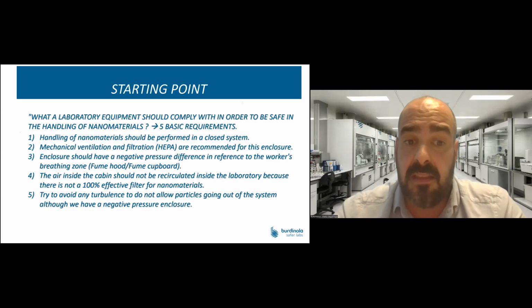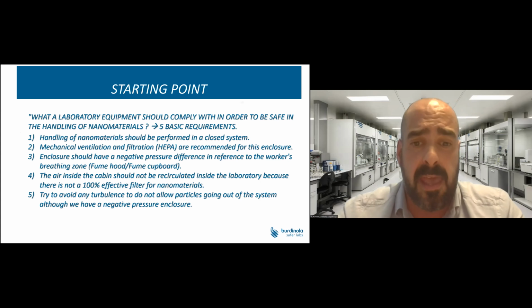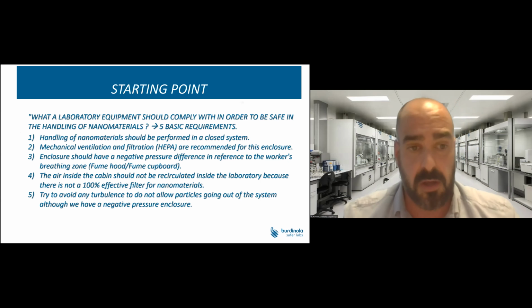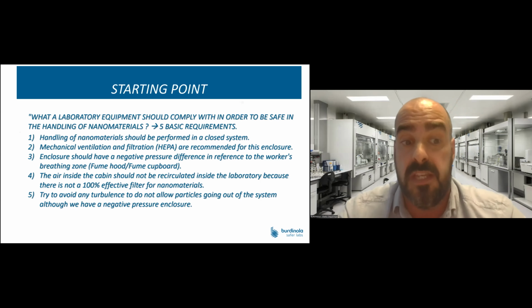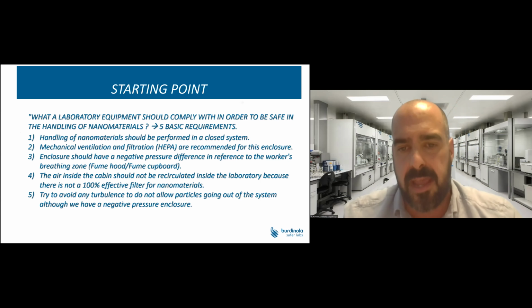And the air inside the cabinet or the enclosure should not be recirculated inside the laboratory, because for the moment there is no 100% effective filter for nanomaterials, not ULPA, not HEPA, no filter is 100% effective, okay? And we should try to avoid any turbulence so particles do not go out of the system. Although we have a negative pressure, we can demonstrate that turbulences can break the containment of the enclosure.